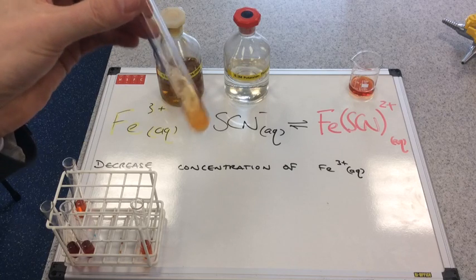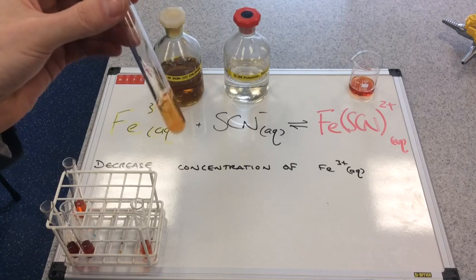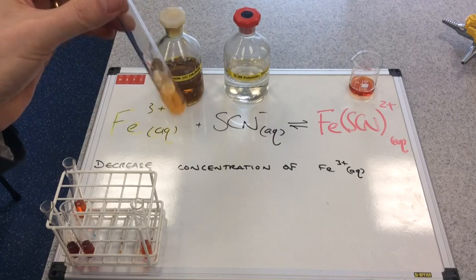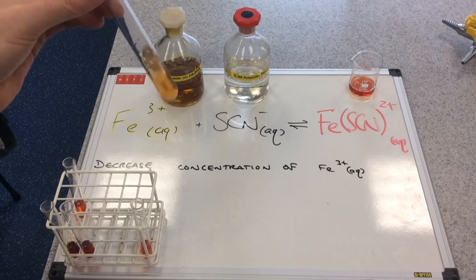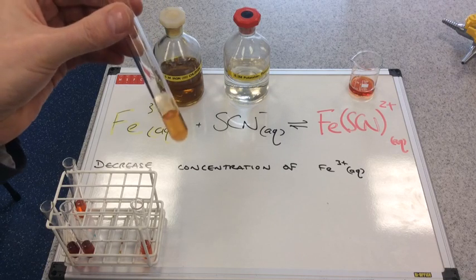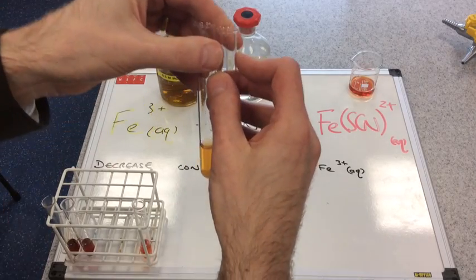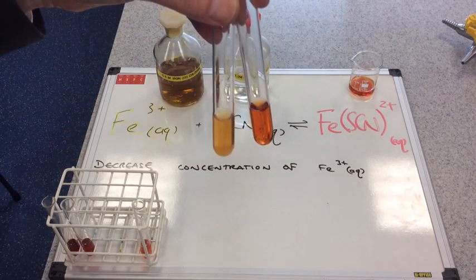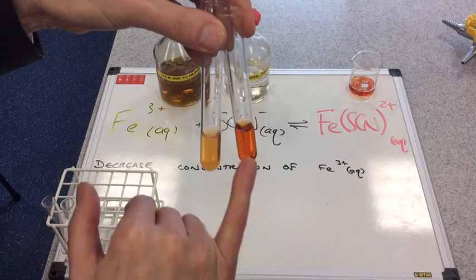I've just added the ammonium chloride. I've given it a shake. And hopefully you can see what's happening to the color. I'll bring the control tube out in a second. But I'm sure you can see actually from just watching this, it's getting paler. I'll bring the control tube to compare. There they are. So this is the new test tube. This is the control.